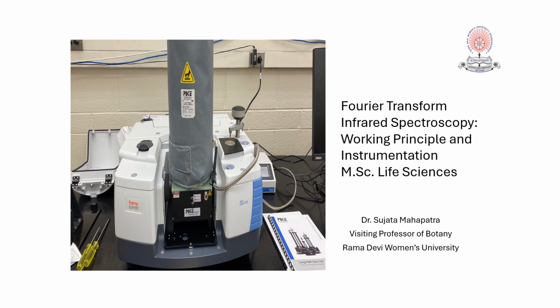In this video lecture, I shall be discussing FTIR spectroscopy. The discussion will include instrumentation, what is Fourier transform, theory and principle of FTIR.